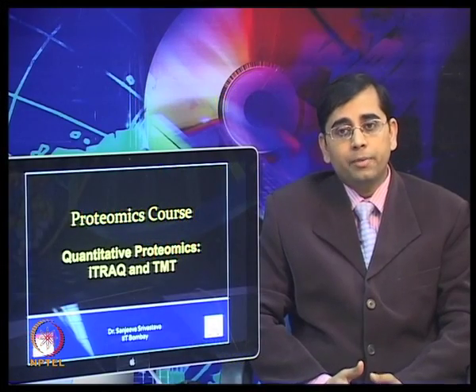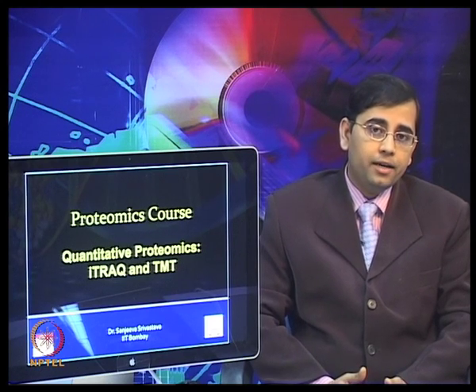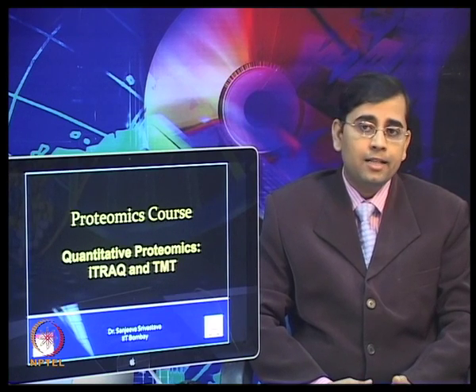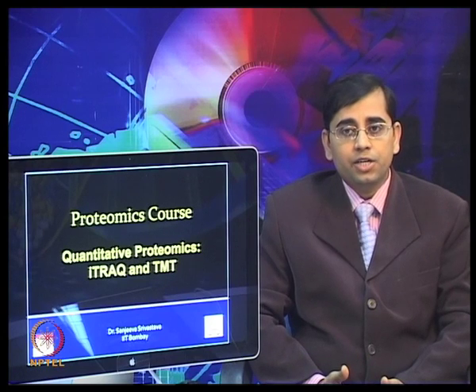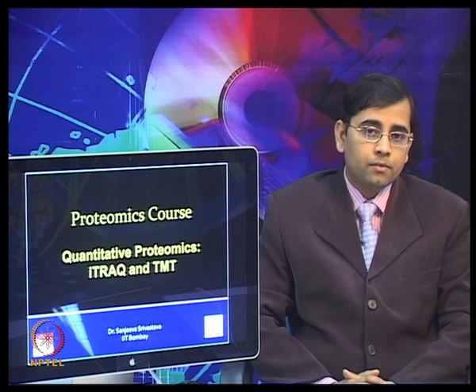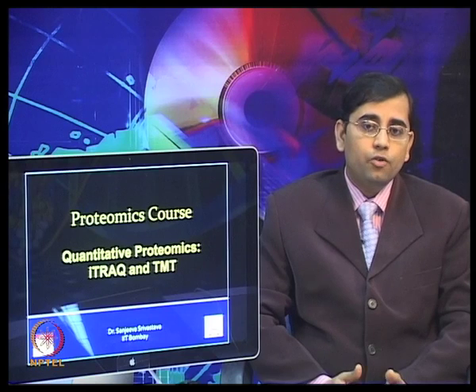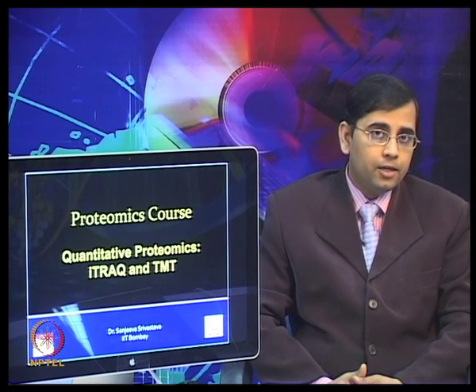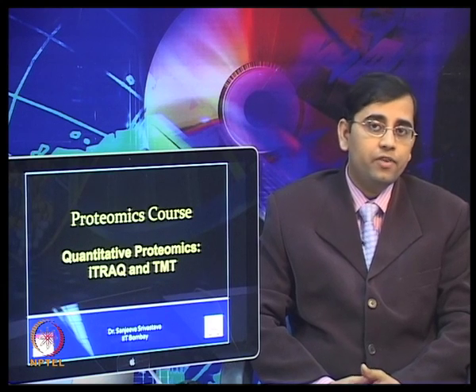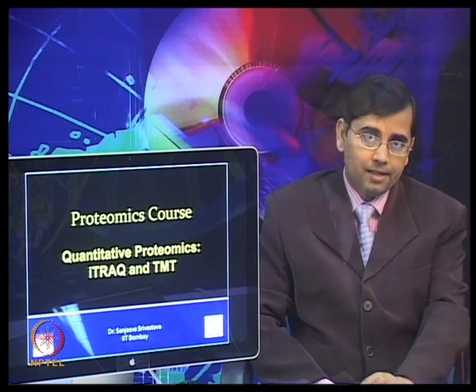Quantitative proteomics aims to answer various questions, including the identification of biomarkers for various diseases and target identification for early diagnostic intervention. Various techniques or strategies have been developed for quantitative proteomics, including gel based approaches such as DIGE, which we have discussed in the last module, and mass spectrometry based measurements.